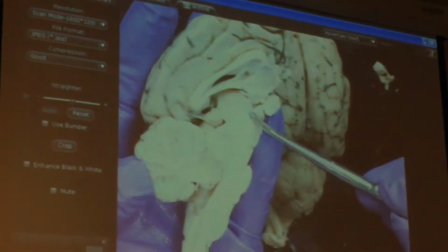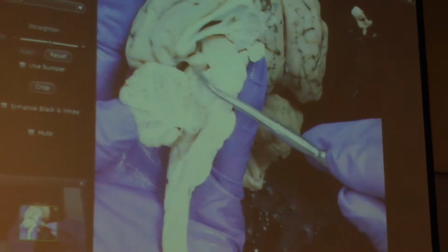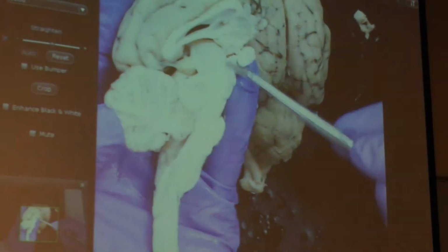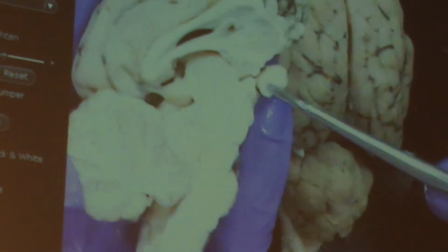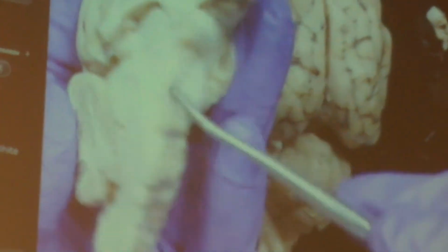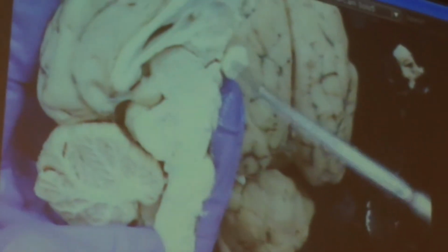Okay, now, when I do my mid-sagittal section, I can see further some structures. First of all, I see right here this round structure, thalamus. This round structure towards the cerebellum, pineal gland. And then right here below the thalamus in this region, you can't see it very well, that's the hypothalamus. But you will see 2 other round structures. This one, which is a piece of the optic chiasm, and then this one behind it, not even that well seen, that's the mammillary body. So again, this right here is the thalamus, this is the pineal gland, this is the optic chiasm, mammillary body, not seen very well here.